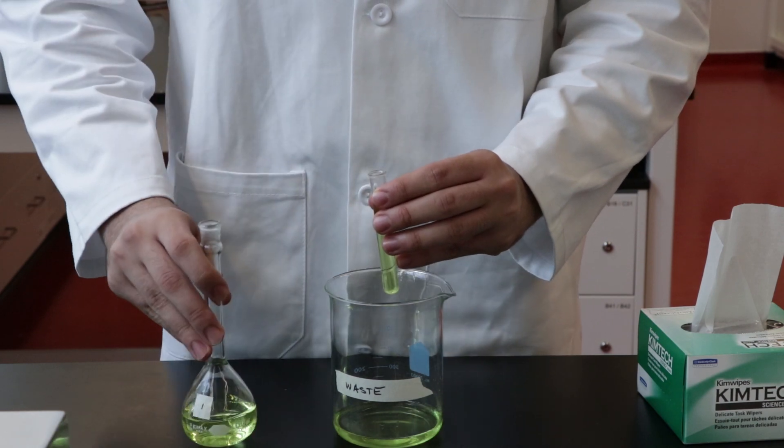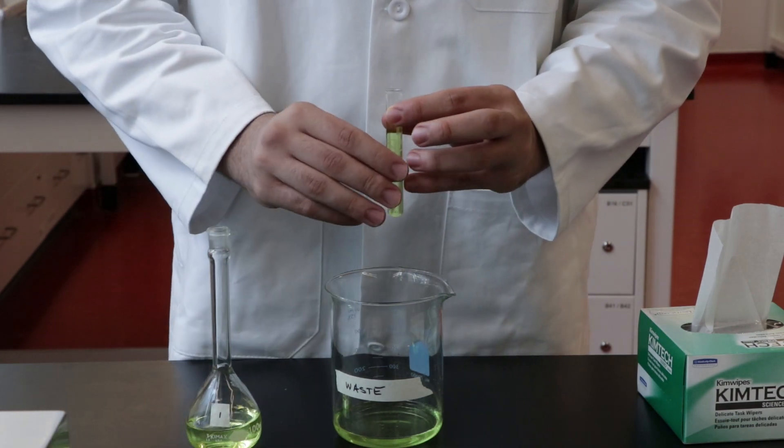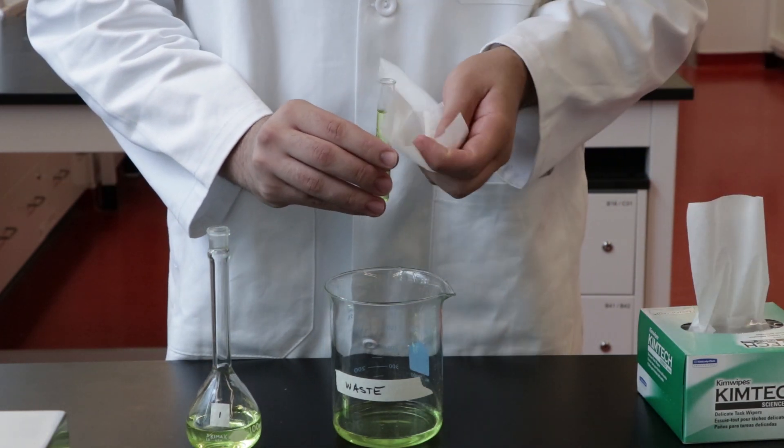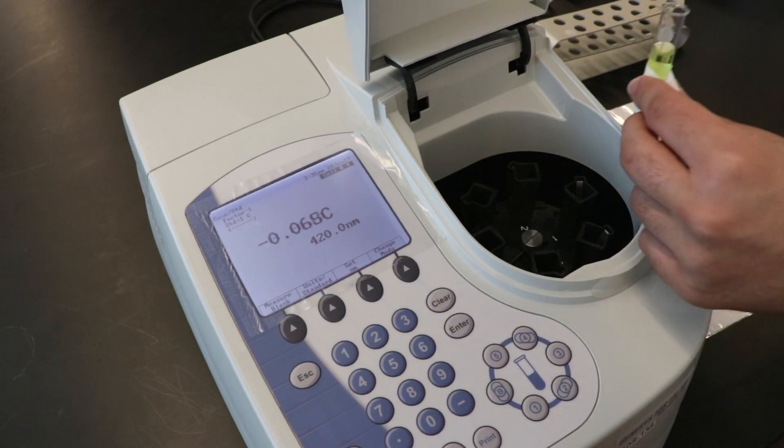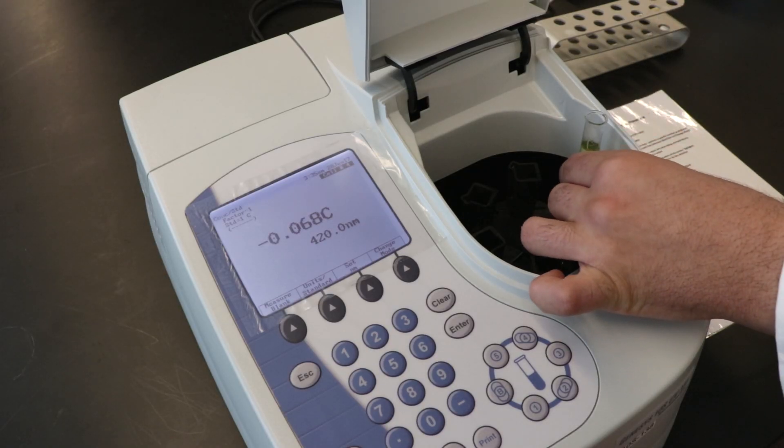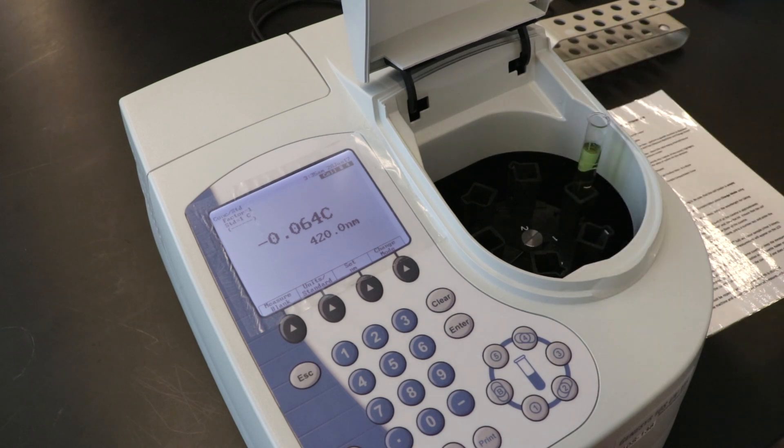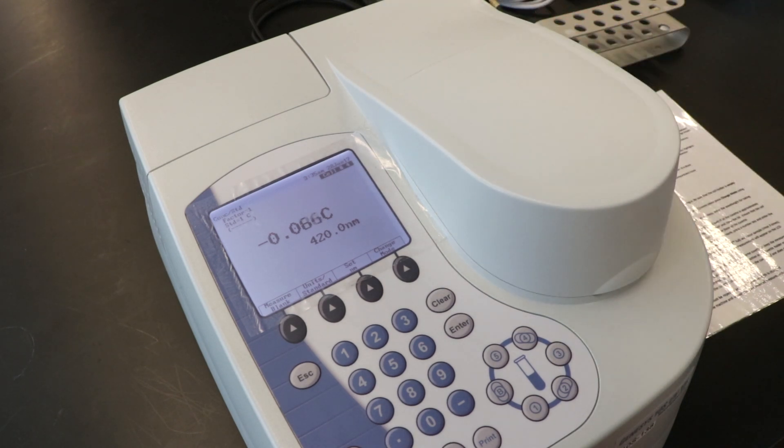Next, fill about two thirds of the cuvette with the solution from flask 1. Clean the cuvette with a Kimwipe and place it in the spectrophotometer. Press the button on the dial corresponding to the position of the cuvette.